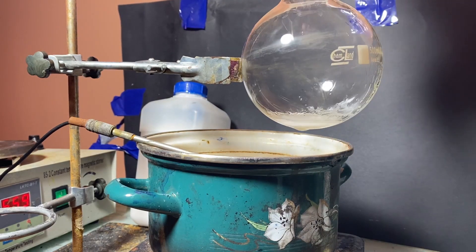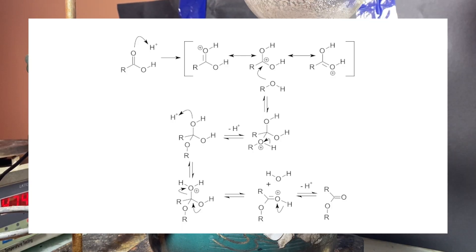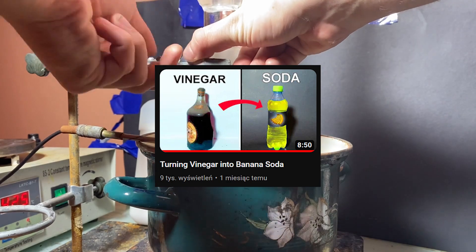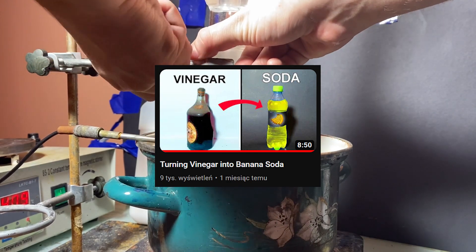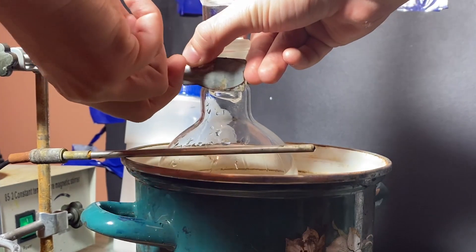As the temperature rolls over around 55°C, a reaction starts happening. This reaction is called the Fischer Esterification — it's a really easy way of creating an ester of a carboxylic acid and an alcohol. As the Fischer Esterification goes on, a bunch of water is produced.